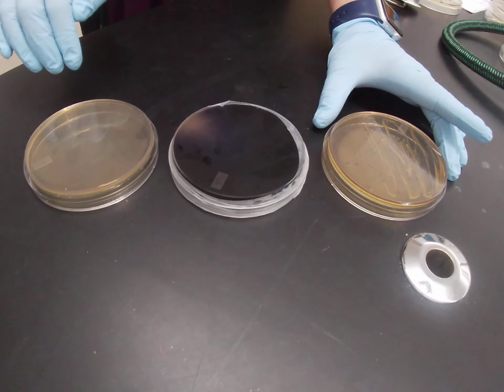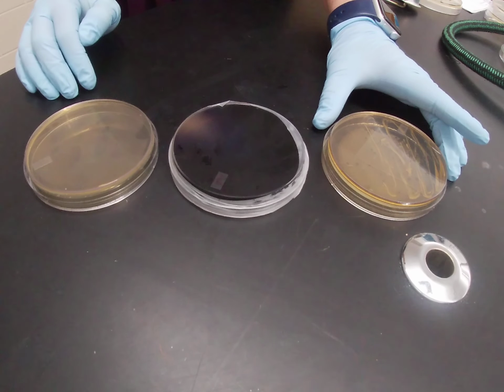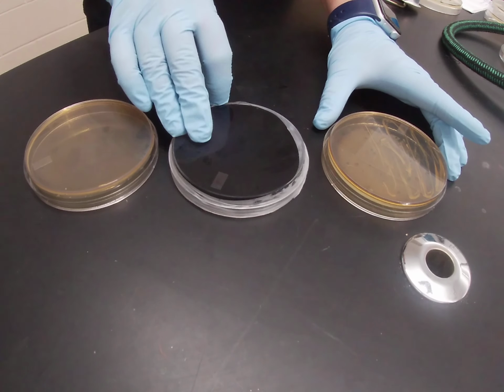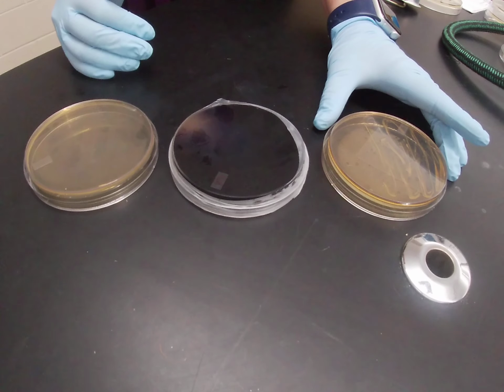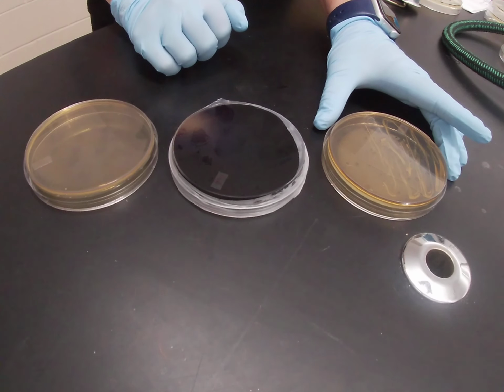Bile esculin is differential based on the hydrolyzation of esculin. Esculin is a molecule that only a few organisms can break down when they're in the presence of bile. Those that can break down the esculin will break it down into a byproduct called esculetin, which can then react with ferric citrate that is also in the agar to cause a pigment change.